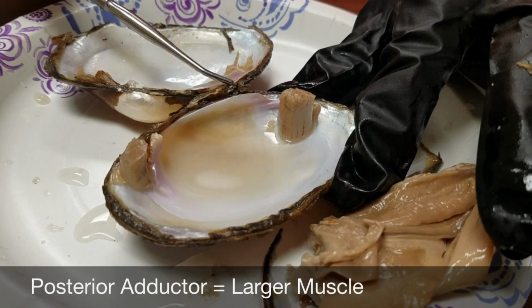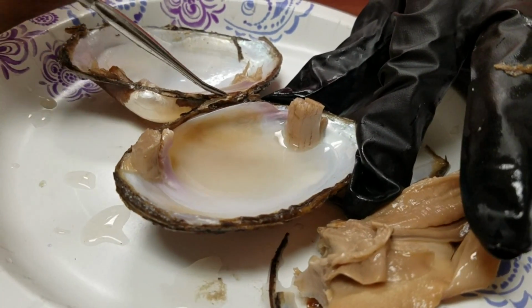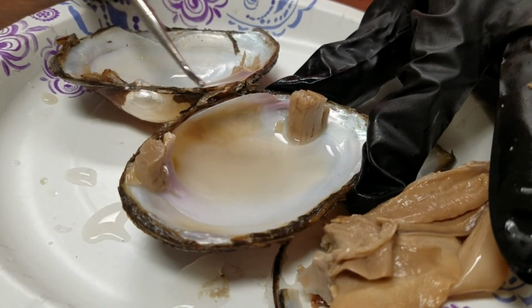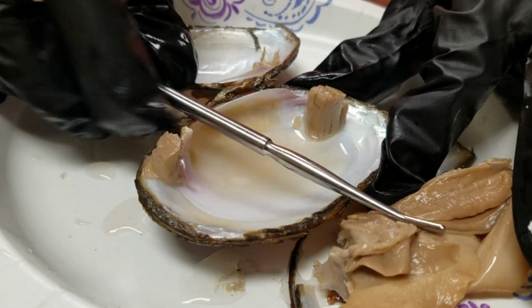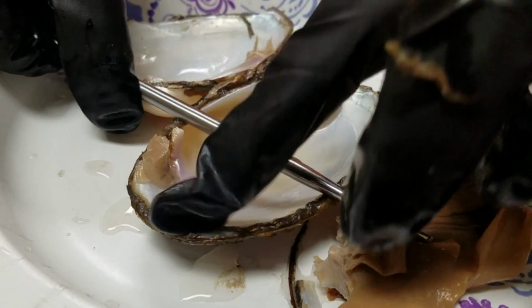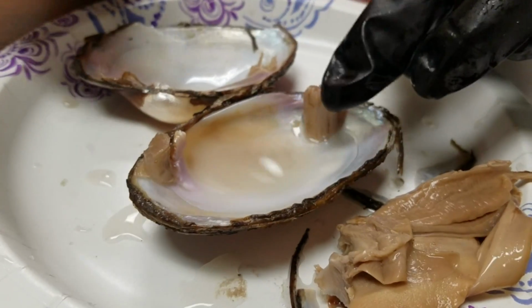A lot of people, like I just did earlier today, try to draw a line from the hinge ligament where that's connected, but that is incorrect. You have to start from the umbo, and when you draw a line straight down from the umbo, you're going to get the smaller anterior side and the larger posterior side.